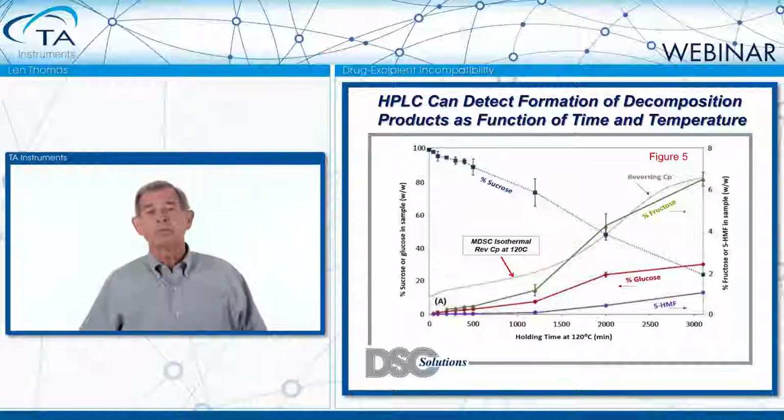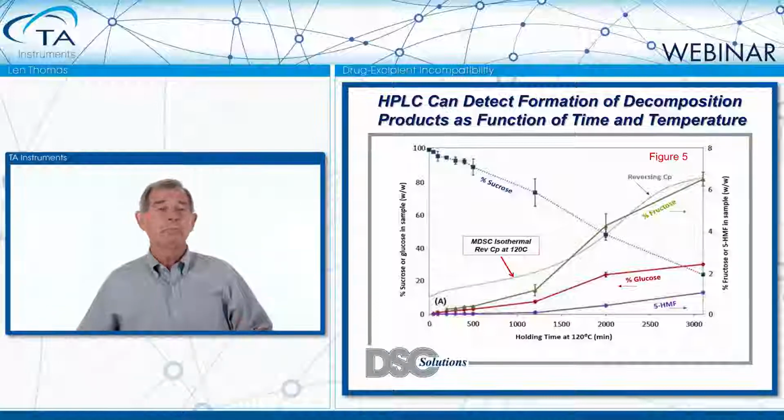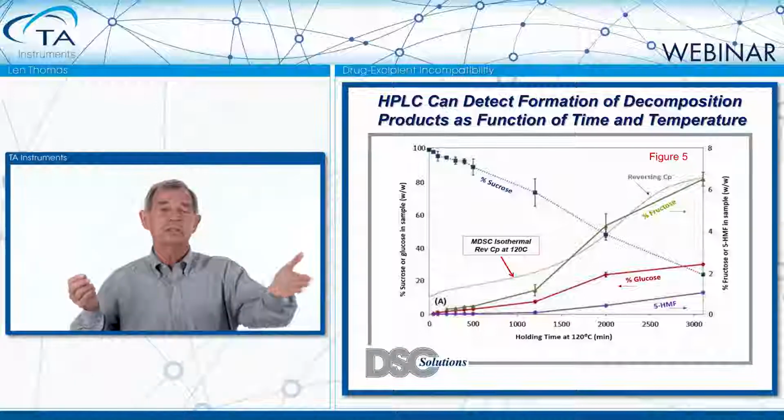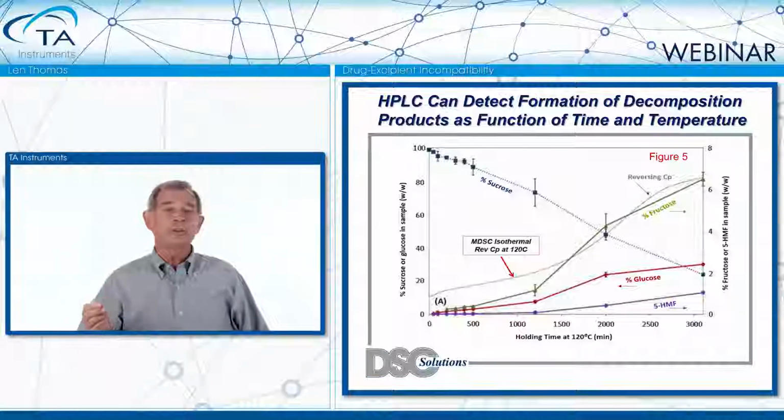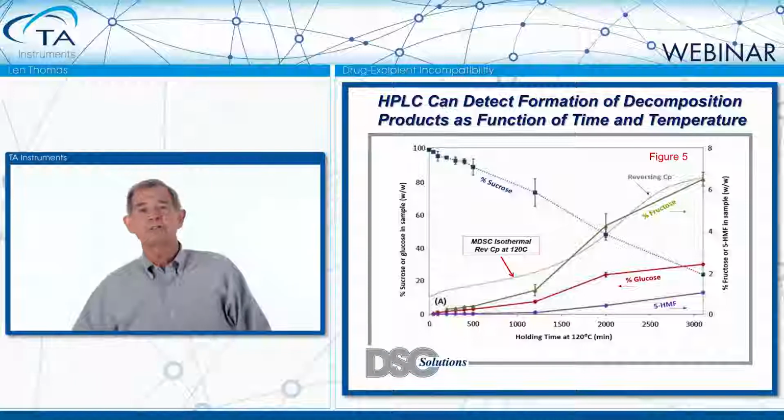And the nice thing about this method is that if you're most comfortable with HPLC, which they used to identify the decomposition products here, then use HPLC. But if you want to use IR, GC, or mass spec, you have the samples now in your vial that had been subjected to this temperature profile. You can go ahead and use any analytical technique you want to do the chemistry.